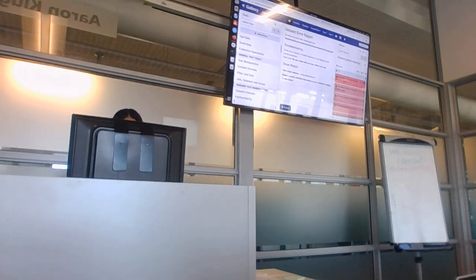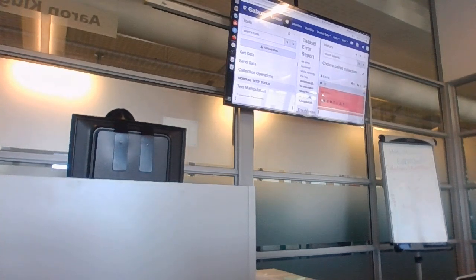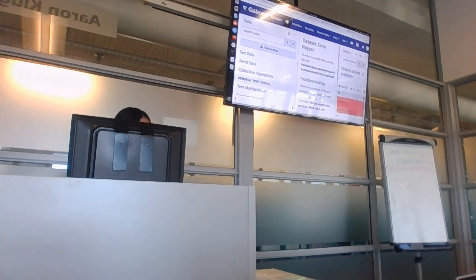So normally it will look like this, right? You would just open it up, and then there's this bug here, the first button. It looks like a little insect. Oh, double click on it. Okay. No, you just click once. Mine I need to double click. No, it doesn't show me. Oh, oops! You should be able to click once.